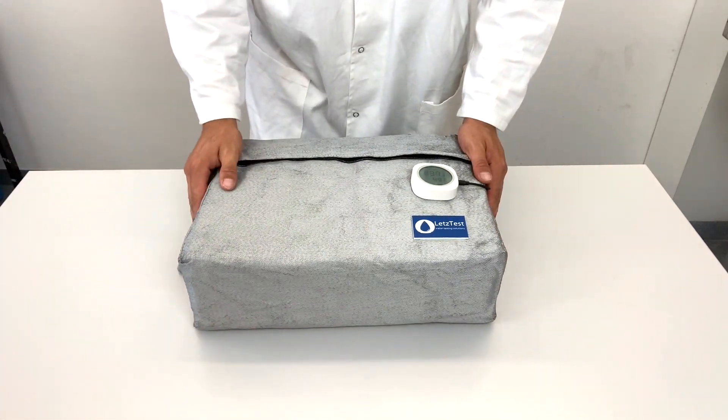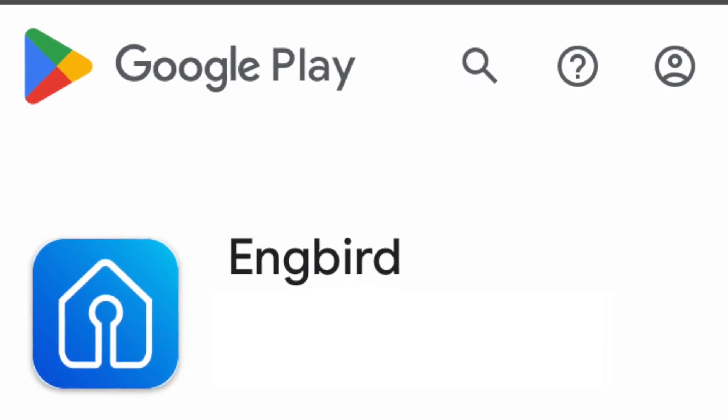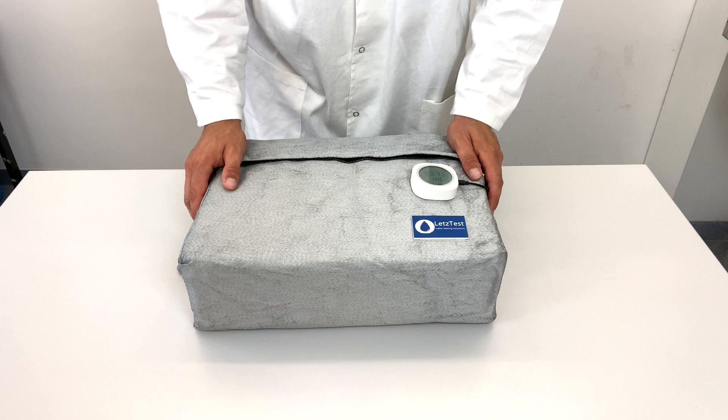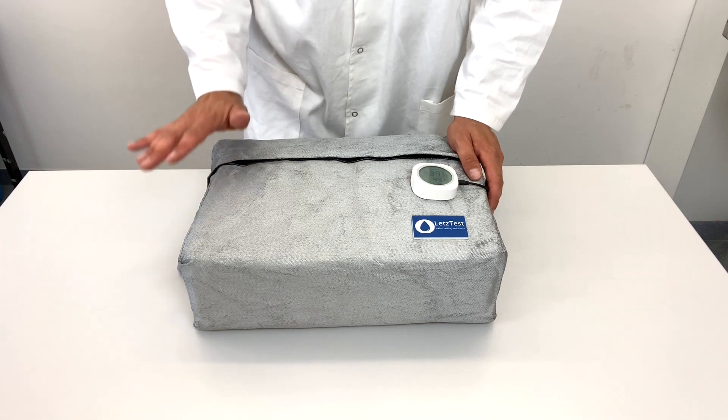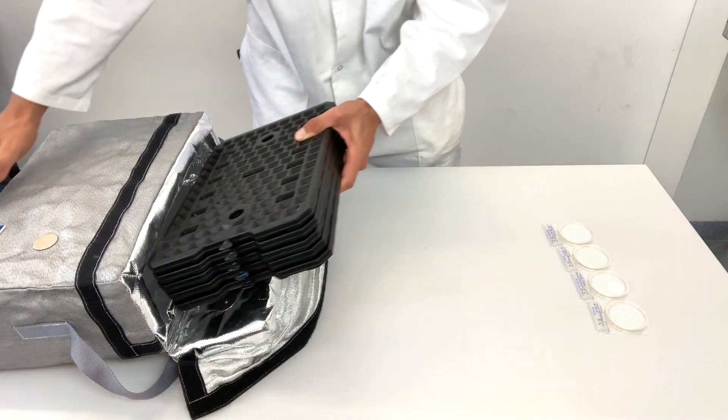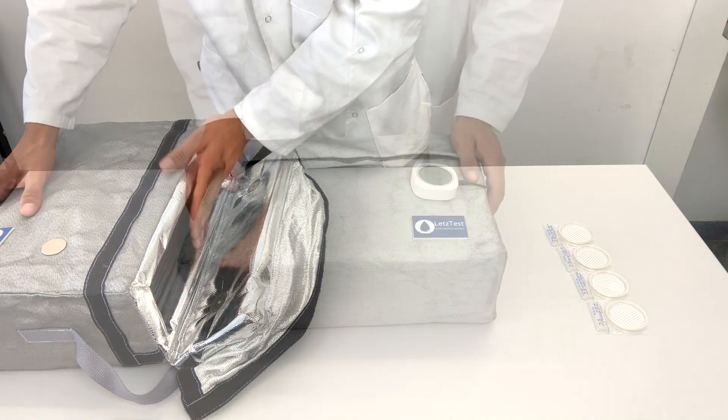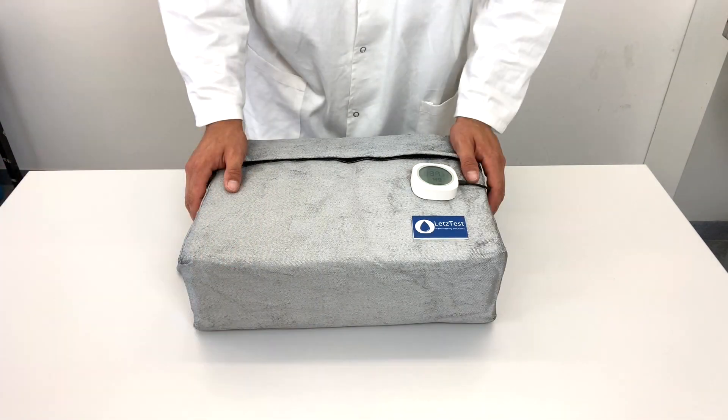The temperature inside the incubator can be monitored and recorded with the Engbird app. Another advantage of the incubator is that it can even cool down to 37 degrees when the outside temperature is higher. Simply add non-activated black plates with a solid substance inside. These will absorb any heat above 37 degrees.